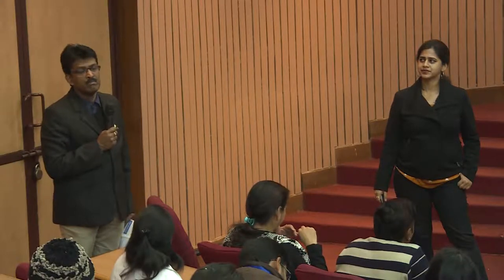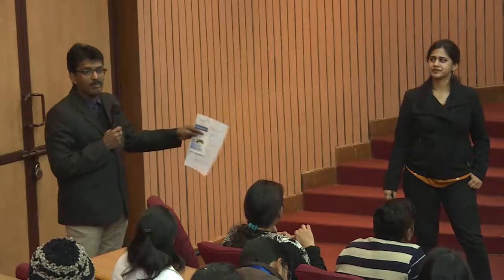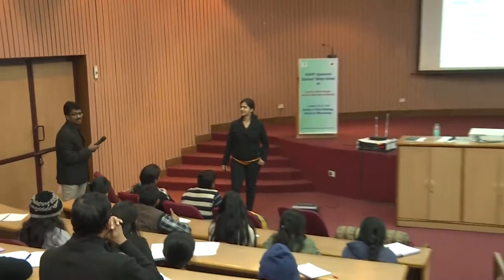For the students, that is a point actually. It's nice that she opened up the topic. You have random error in PacBio long reads because one of the speakers highlighted it here, and Illumina has maybe systematic error, they say, but when we combine these two, the random error and the systematic error will be corrected by either reads. Am I right? Yeah.